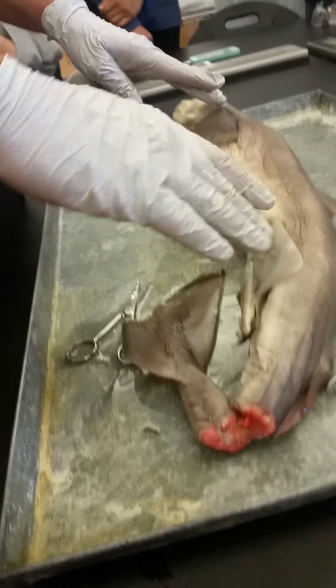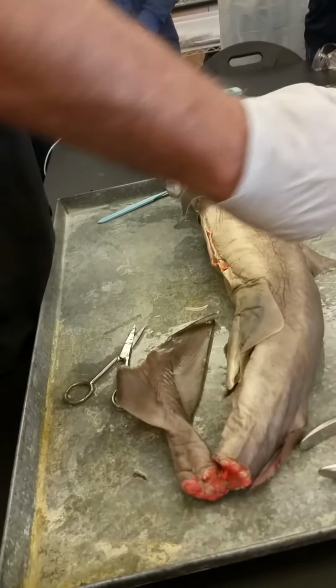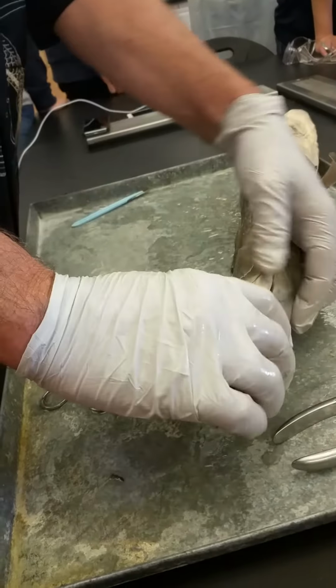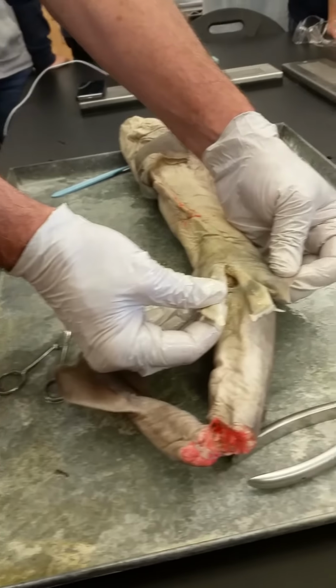So it's kind of like in the bony fish, you're standing upright with your tail back here, whereas in the sharks, you're more like lying down, your tail going between your legs. So your pelvis is moved back that way. These are the pelvic fins. In the males, the inner edge of each pelvic fin is coiled into this copulatory organ. That's called a clasper.